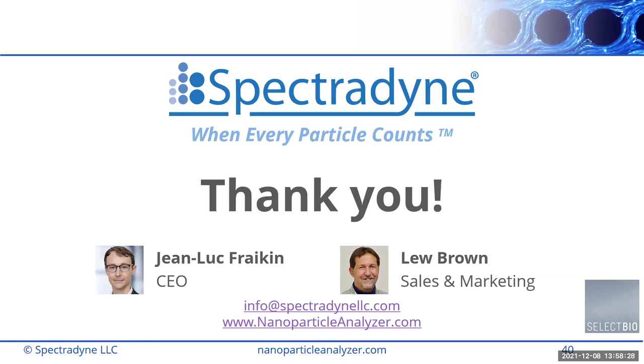This is the first question. The second one, what about the sample preparation? Is there a minimum volume for the sample for microfluidic system measurement, and does it have to be diluted or not? Thank you.